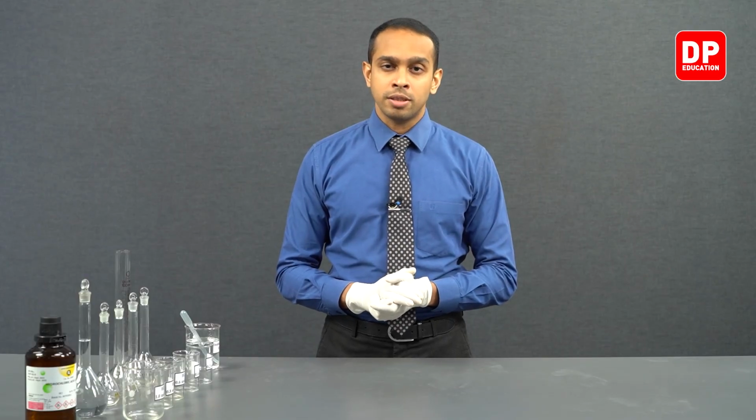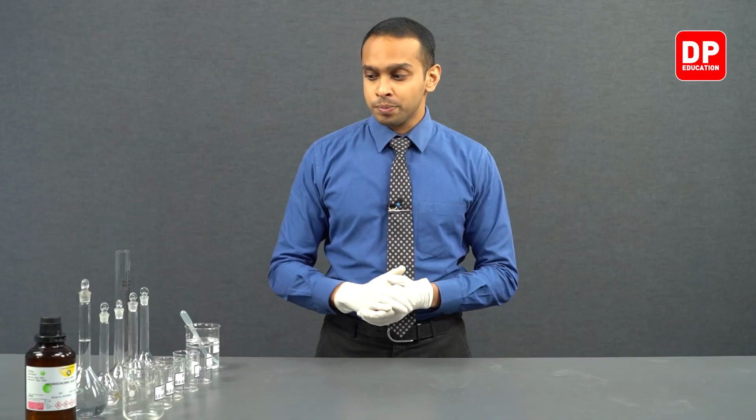Now students, we just observed how the 1 mole per decimeter cubed concentrated HCl solution was formed. It is now time for us to prepare 0.8, 0.6, 0.4 and 0.2 moles per decimeter cubed concentrated HCl solutions. To prepare these HCl solutions, we will be using the 1 mole per decimeter cubed HCl solution we prepared earlier.